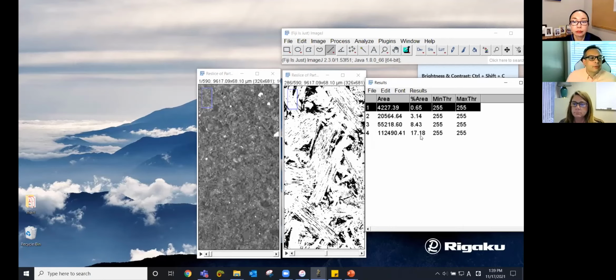We'll keep going here. Don asks, is there a commercial version of ImageJ coming out? For industrial CT, he had heard there might be one coming in the future. Have you heard any such murmurings? A commercial version of ImageJ, for industrial CT, let's say, so maybe it's a little more focused.